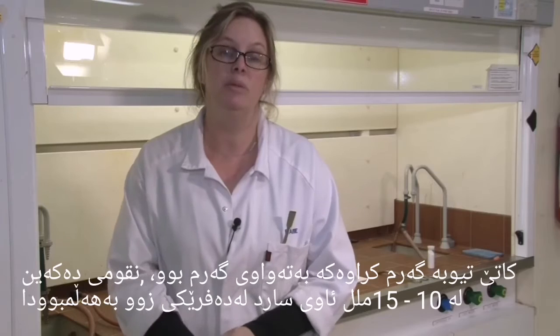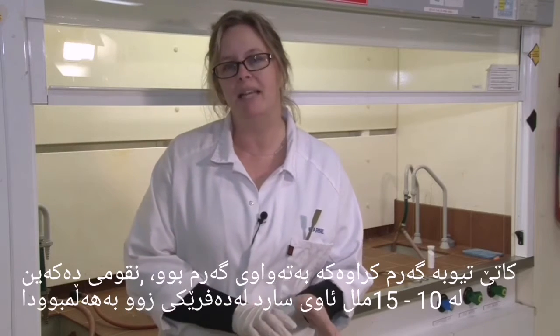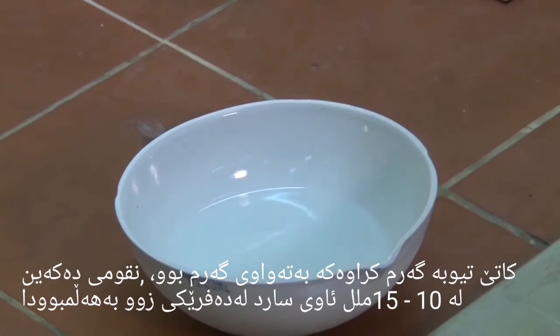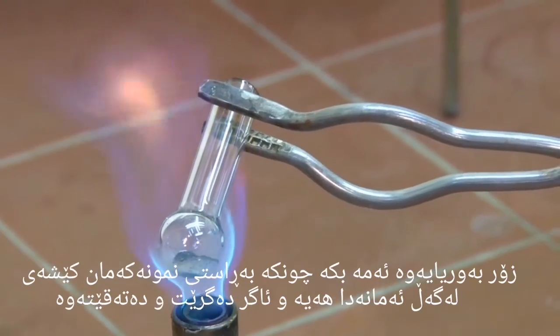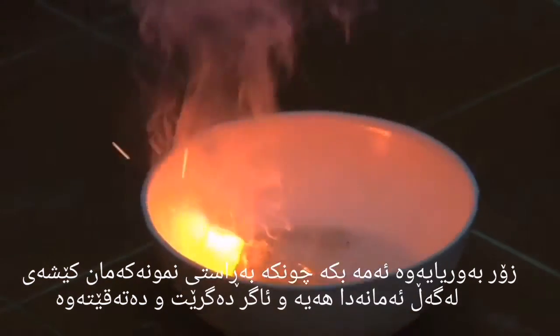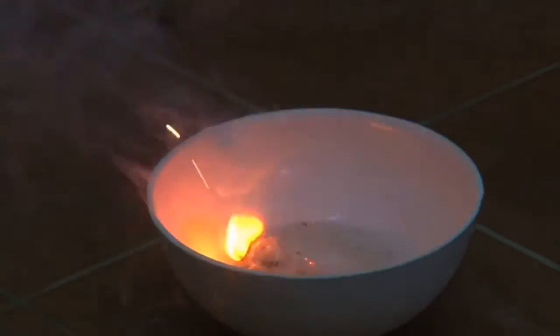When the ignition tube's really hot, plunge it into about 10 to 15 mL of cold water in an evaporating dish. Be really careful when you do this because the sample's likely to spit, catch on fire, or even explode. Make sure it's at the back of the fume hood and you've got the door of the fume hood closed.